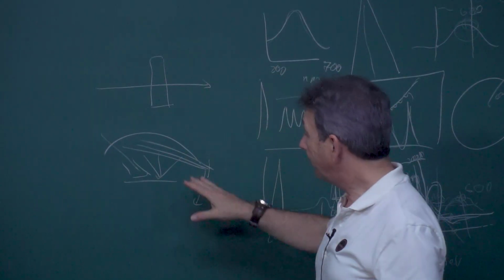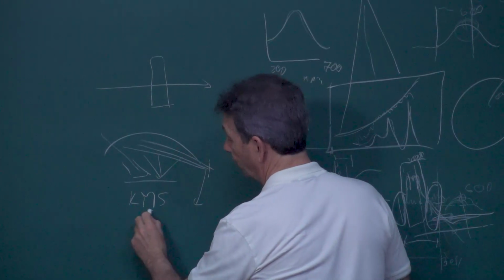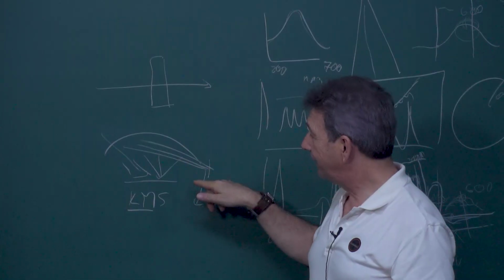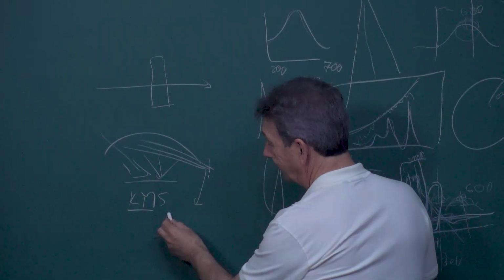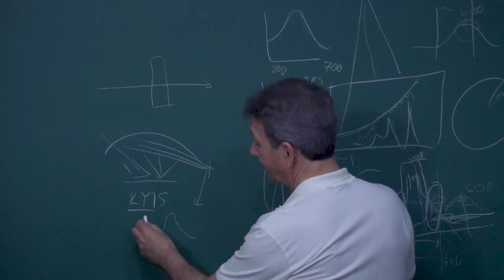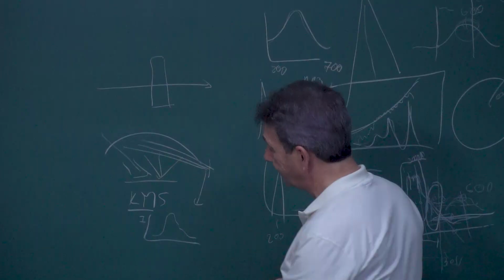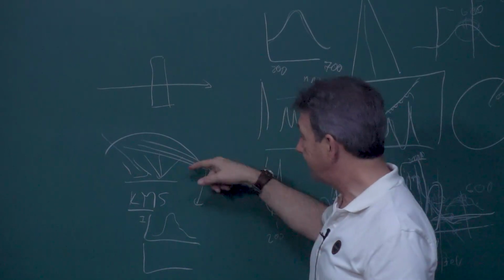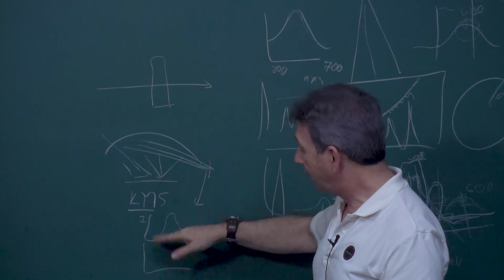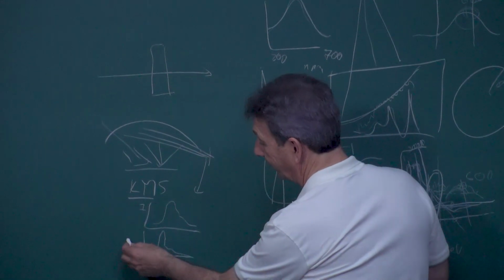What the Kubelka-Munk-Schuster, KMS, function is doing is calculating a way to represent the intensity you are getting here, because if you measure it, you get an intensity, but that intensity is apparent. The Kubelka-Munk considers that light is being scattered, collected at very many angles and directions, and it makes a correction, giving a better defined profile.